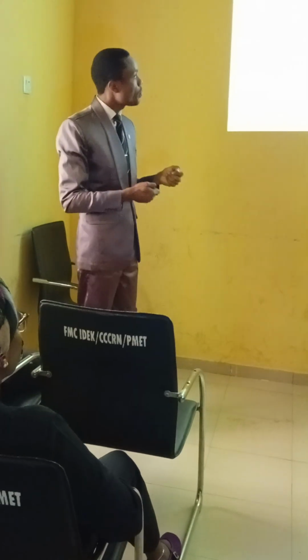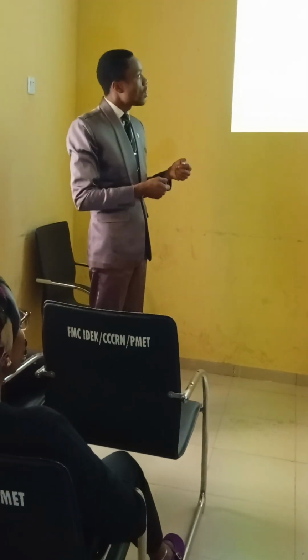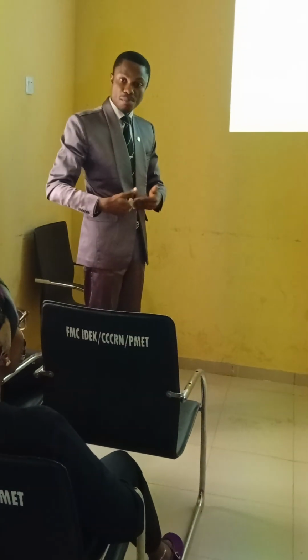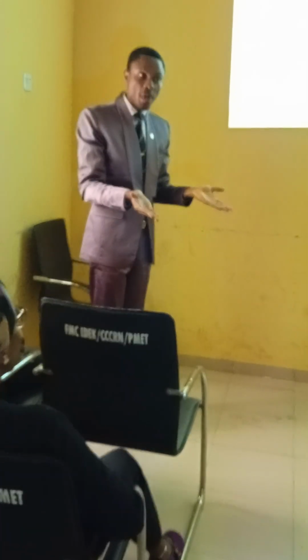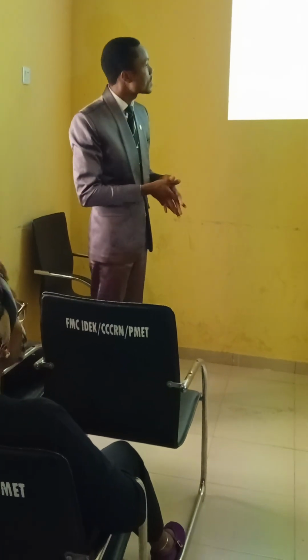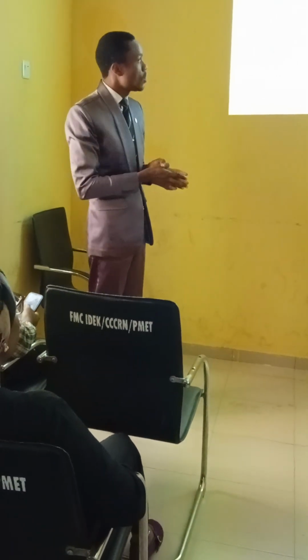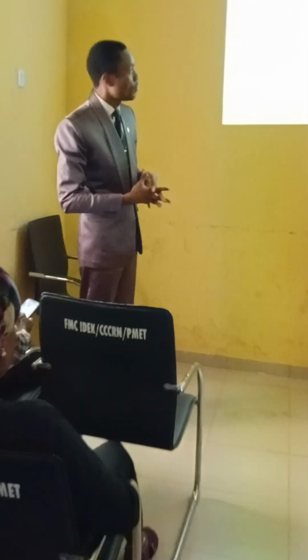If these tissues were not properly processed, even though the tissue may have some true lesions, because the tissue is not properly processed and prepared, it will appear as if there is no lesion when viewing the slide because of this artifact. So that's why it is important that awareness of artifacts is made to help us distinguish artifacts from true lesions.